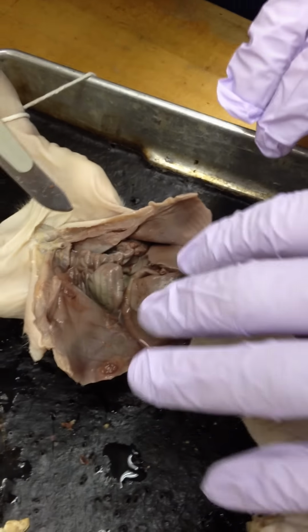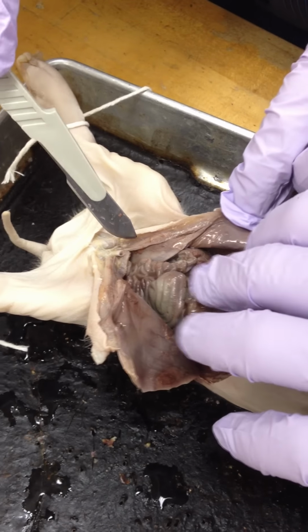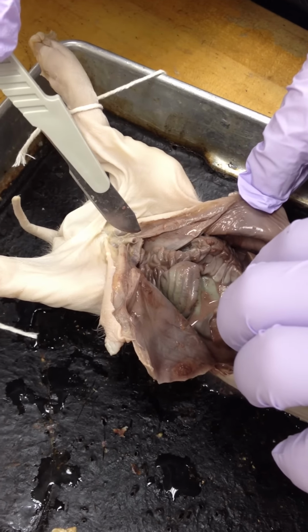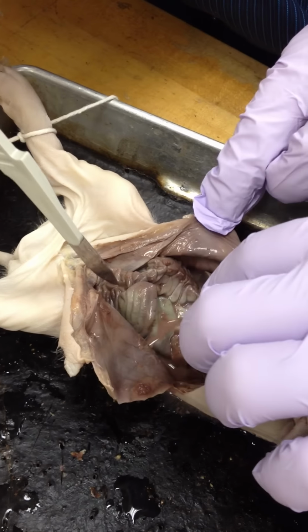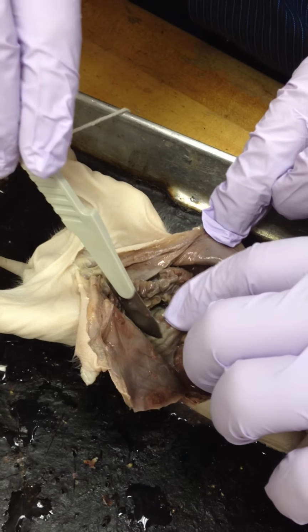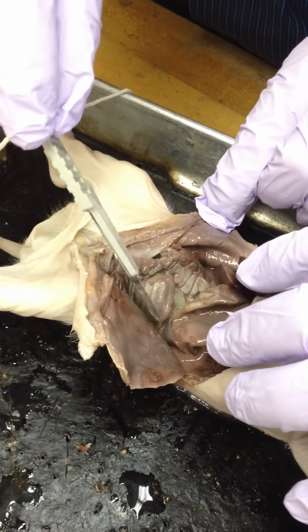This is the liver, right? Yep. The stomach should be right underneath the liver. Maybe I punctured it. Yeah, maybe that's what that is, possibly. The small intestine is all these. Sorry, that's the large intestine. There it is, the ascending, transverse, and descending.